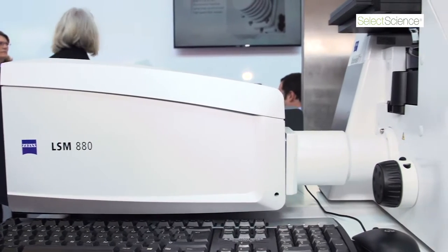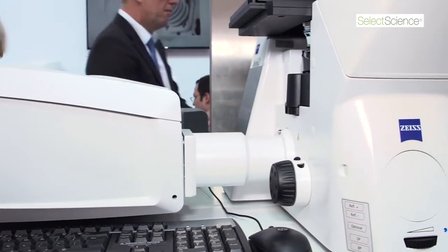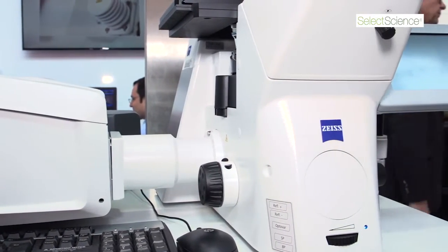What we see here is an LSM 880 fitted on an Axio Observer Inverted Microscope stand. The LSM 880 consists of two parts: the scan head, where the scanning takes place, and where the laser fibers are coupled in and the spectral imaging takes place.